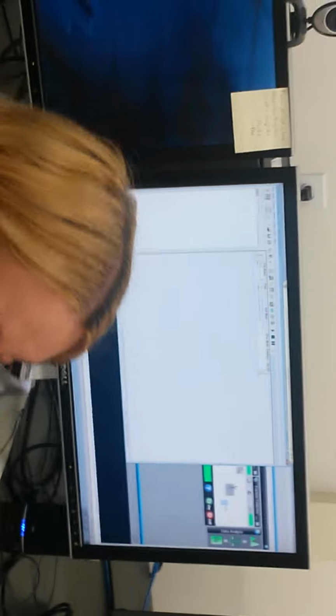Then this is going to start going through contact closure and trying to get ready. While that's waiting, you're going to highlight the second row, hit the test tube again, hit okay again, hit the test tube twice, hit okay twice. So you're going to do the clean 2 times. You highlight, hit okay. It's going to look, highlight, hit okay.